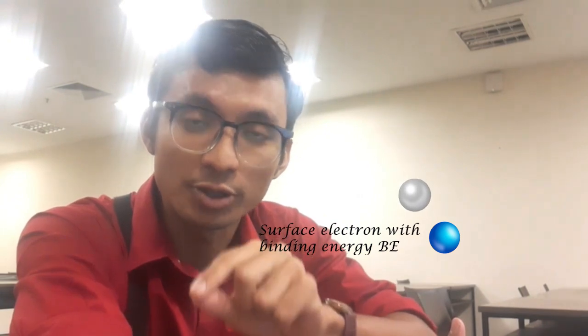Here, the energy needed to release the electron is proportional to the frequency of the incident photon and not the exposure time or the intensity of the photon itself. The motion of ejected electrons from a material surface is associated with their kinetic energy, which is also linked to the binding energy of each electron.